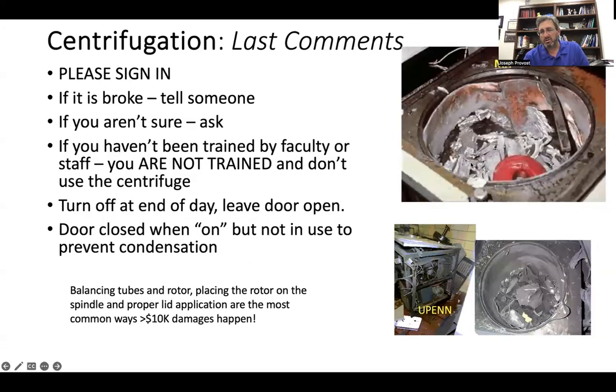Why do I keep talking about this? This is the inside of a super speed centrifuge where there was an imbalance. It caused the spindle to break, and inside, like a spinning top, is a bomb ready to blow up. You can see it's armored with this metal here, and the metal was just sheared. Same thing happened here, where even the sides fell off, for God's sake. And here you can see that metal armor was just broken up in small pieces. It doesn't take much, right?